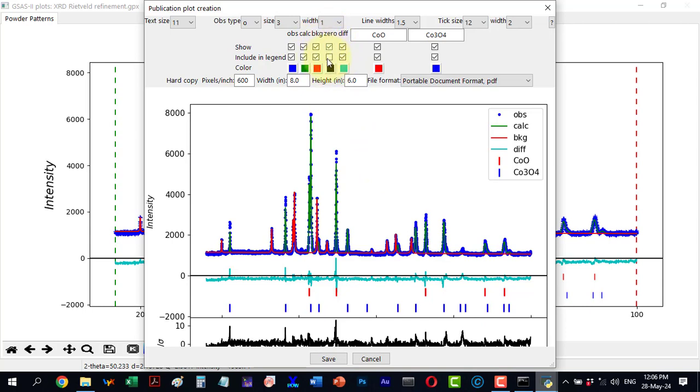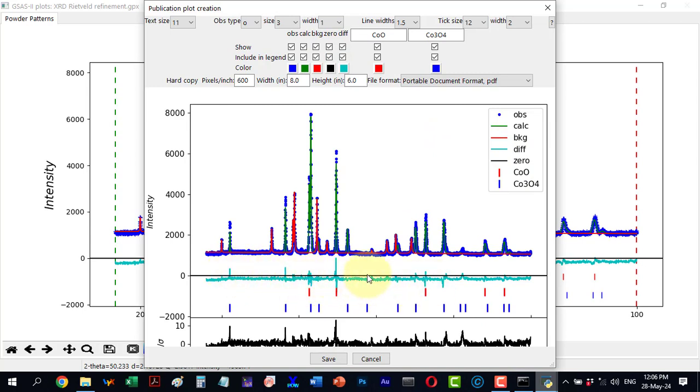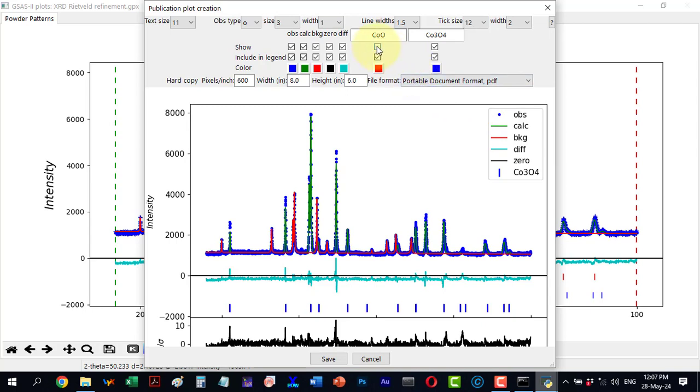The zero value is not shown by default, but I can choose to display it. I can also choose whether to show the phases involved. If I hide one phase, it disappears from the plot in legend.